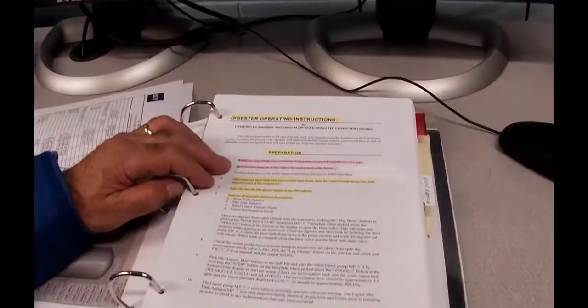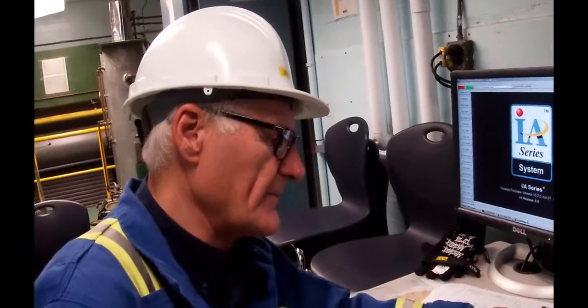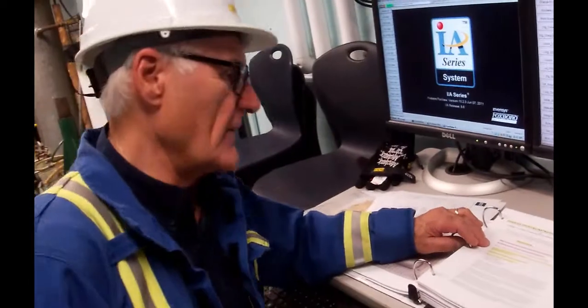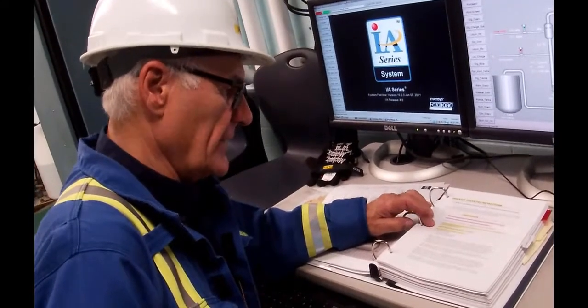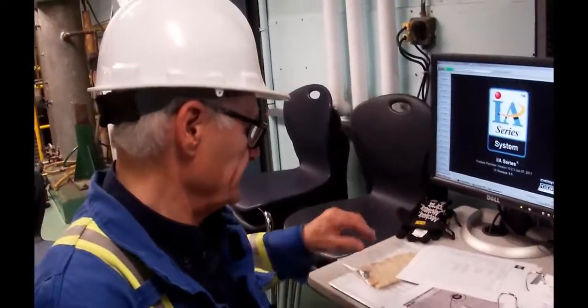So the first thing we have to do is go downstairs to the scales, or actually the cooler, get the bags of chips, take them over and weigh them. Item 2, do a moisture check, which we've just done. You've seen that information. Perform a titration. We did that previously. You saw that as well. And then we've got to start up the room and blow tank fans, turn on the 24-volt power in the cabin, and then turn on all the electrical disconnects. So there's some mechanical things that we've got to go do now.